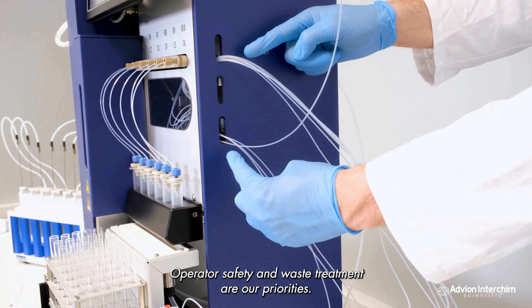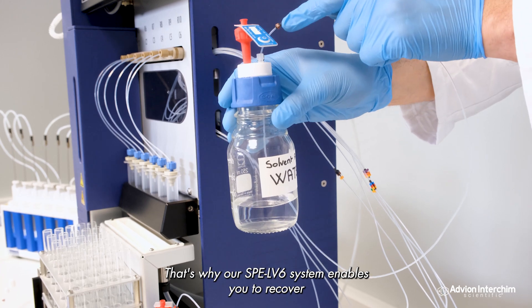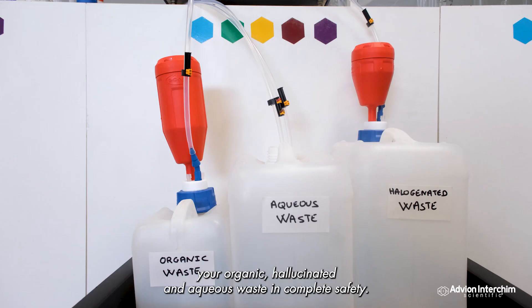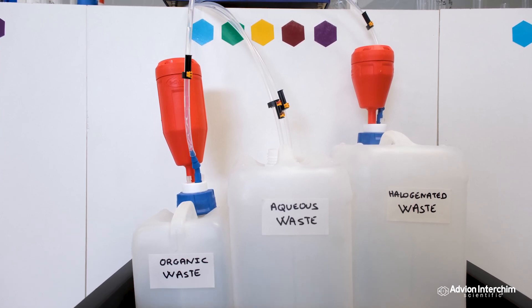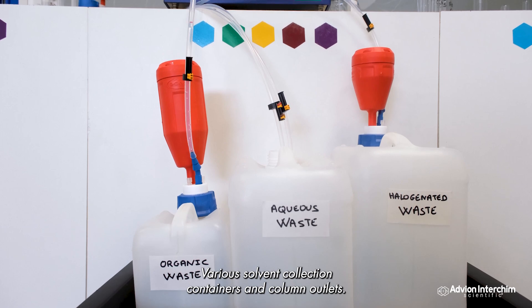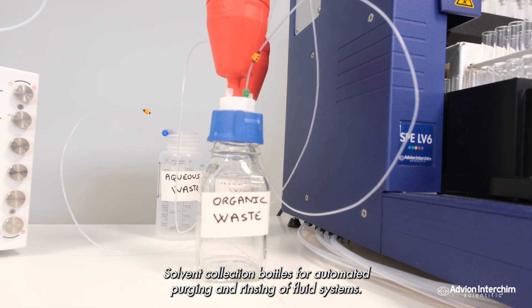Operator safety and waste treatment are our priorities. Our SPE LV6 system enables you to recover your organic, halogenated, and aqueous waste in complete safety. Various solvent collection containers at column outlets, and solvent collection bottles for automatic purging and rinsing of fluid systems.